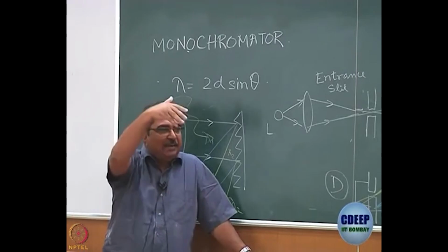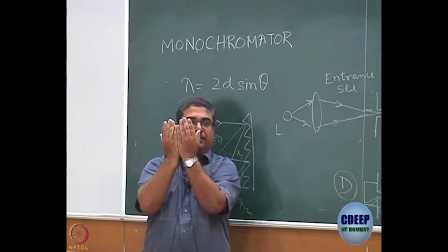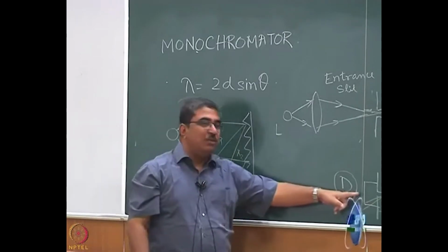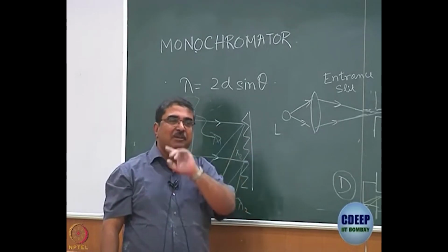One thing I can do is I can move the slit. Right now I can see only Vikas. If I move it like this, I can see only Shobna, right? So I can move the slit. But then, as I told you, we put the detector on the slit, so generally you do not want to move the slit and the detector. What else can we do?